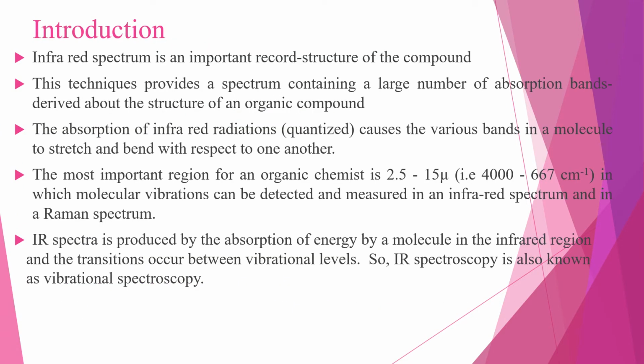Infrared spectrum is an important record which gives sufficient information about the structure of a compound. This technique provides a spectrum containing a large number of absorption bands from which a wealth of information can be derived about the structure of an organic compound.